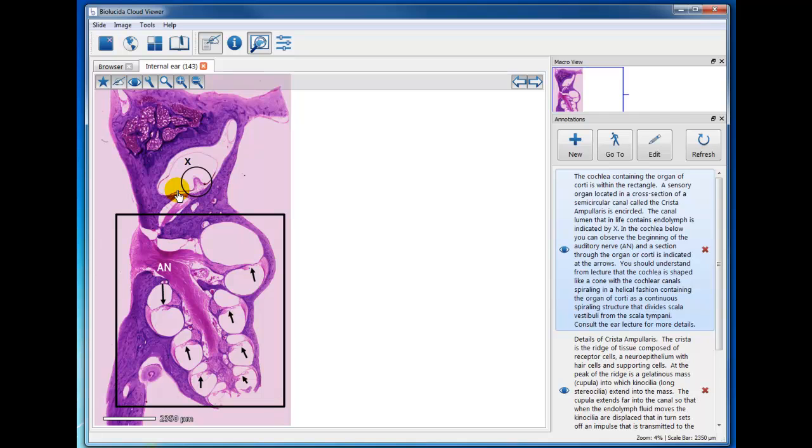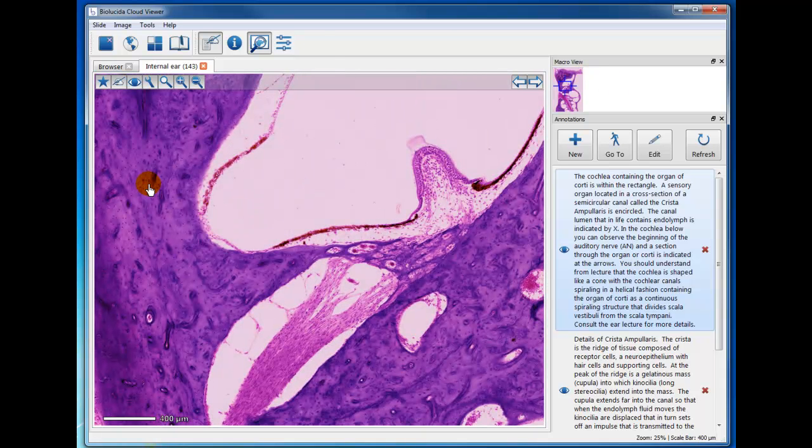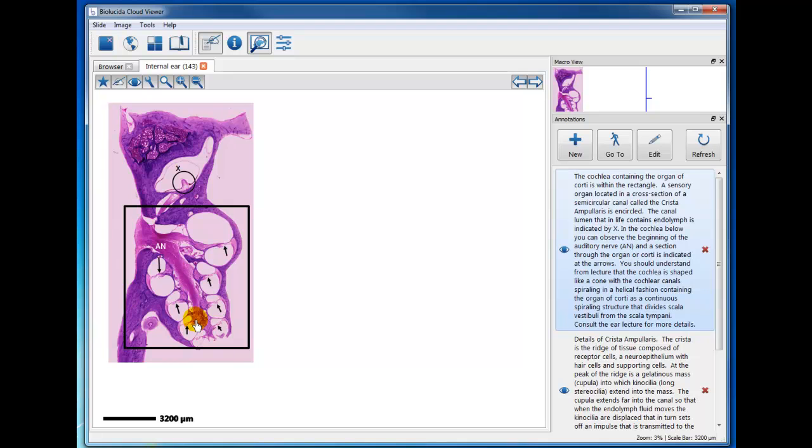Then above is a section through one of the semicircular canals, in the enlargement of the canal called the ampulla, and there's a crista here. Now, you should appreciate the fact that we had to adjust the color so we could see the details, particularly of the gelatinous mass on top of the crista here in the semicircular canal, so that the bone appears bluer than it really should. But this is compact bone with Haversian canals surrounding these structures. So all of the cochlea and the semicircular canals are encased with a bony framework.